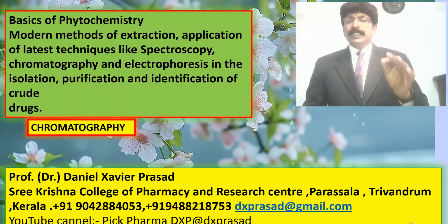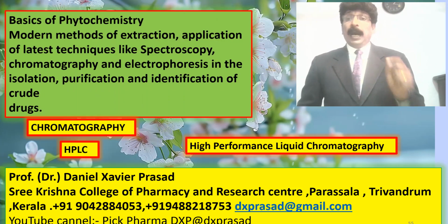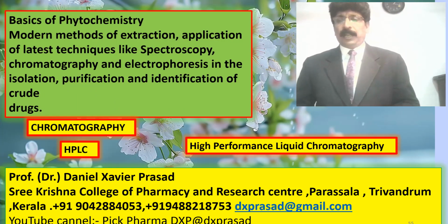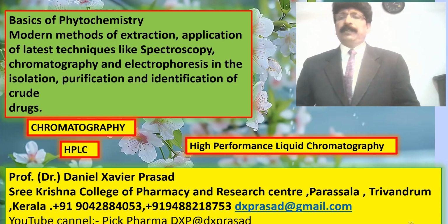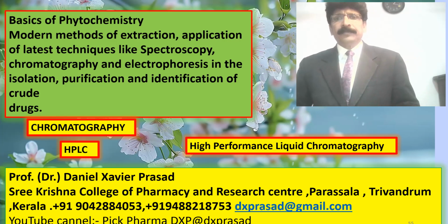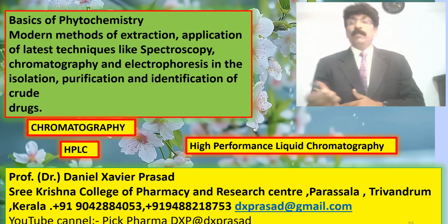Chromatography, this one is an important instrument, HPLC, high performance liquid chromatography. In some books they used to write even high pressure liquid chromatography, because we have used pressure here for the mobile solvent to move in the column. Column is also not as you think, it is not a very big one, it's a very sophisticated and minute and small column nowadays.